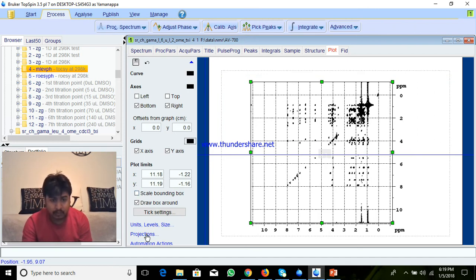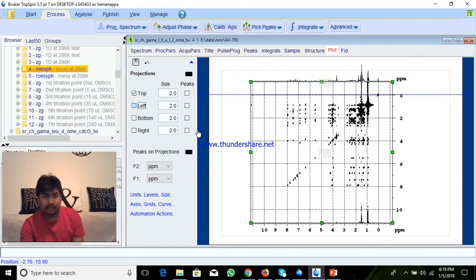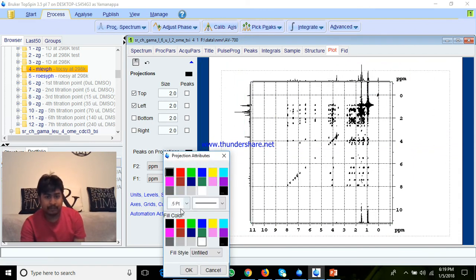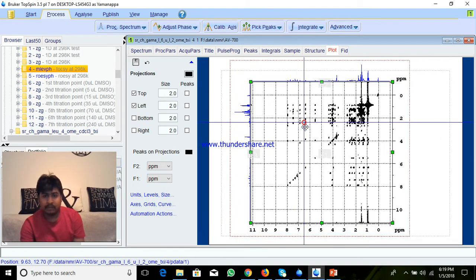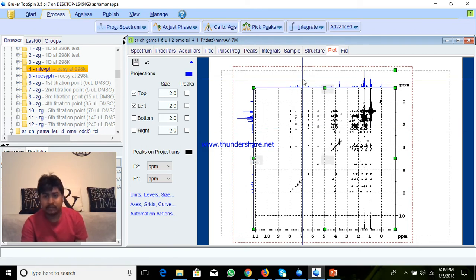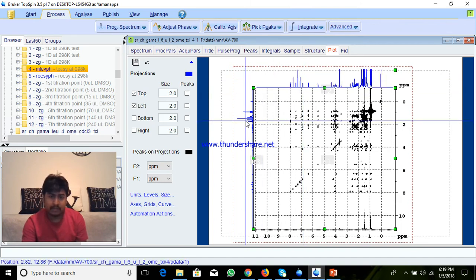If you want to increase the intensity of the projection, just left-click and scroll up and it will increase. If you want to change the colors inside, you can here give positive, or I can give blue, a little bit thick. And this one is negative — different color — you can give dots or anything. So you can change whatever you want.